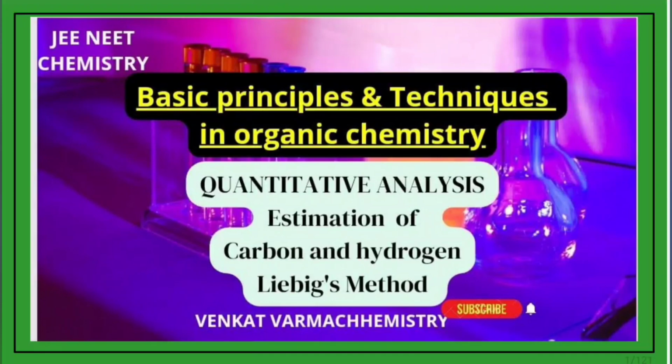In this session, I am going to discuss quantitative analysis. In the previous session, we learned about qualitative analysis, the detection of elements like carbon, hydrogen, nitrogen, halogen, sulfur, and phosphorus. In quantitative analysis, we are estimating the elements.